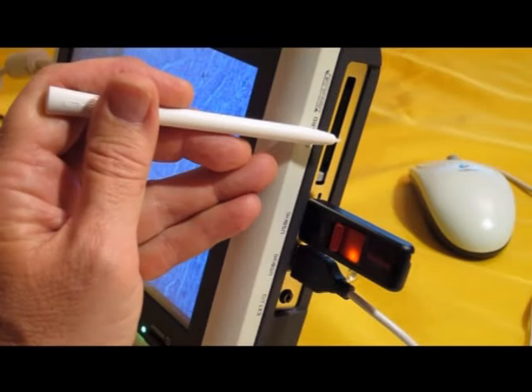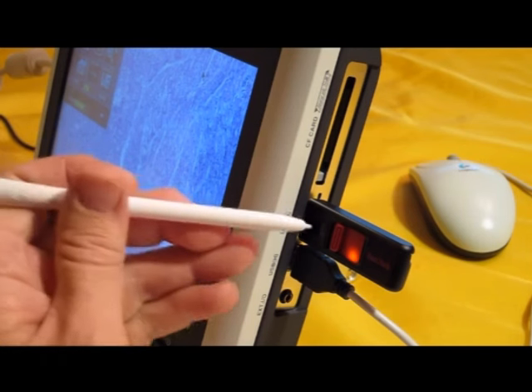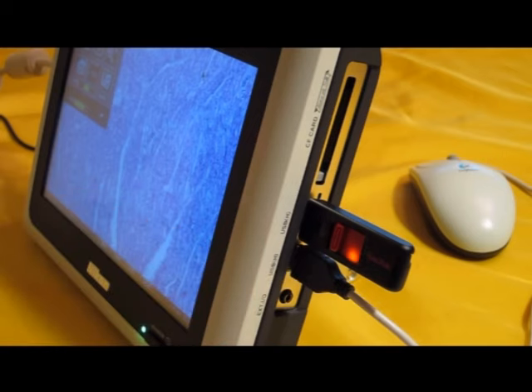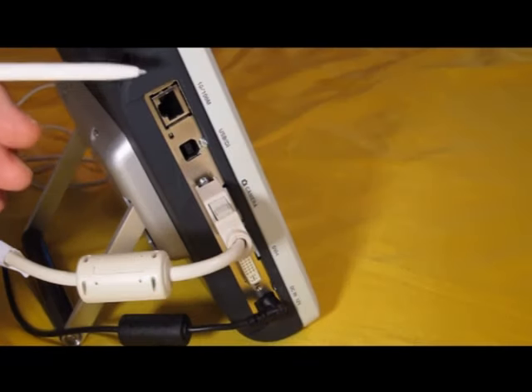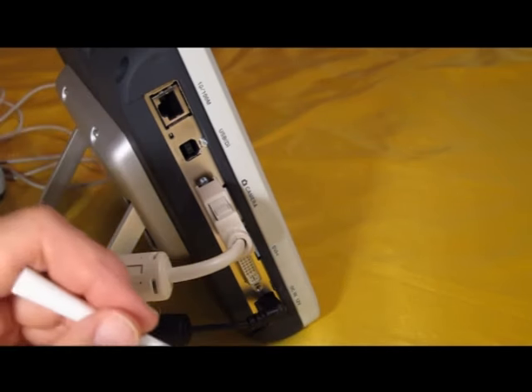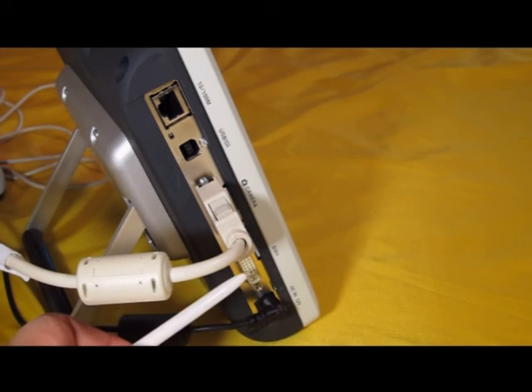Images can be saved to a flash card or a USB memory stick. A mouse can be inserted here. Real-time remote viewing is done via the network port. A USB port connects a computer, and an external monitor connects here.